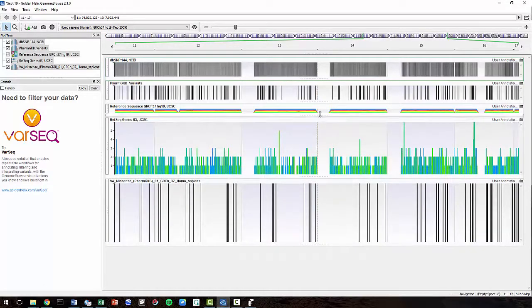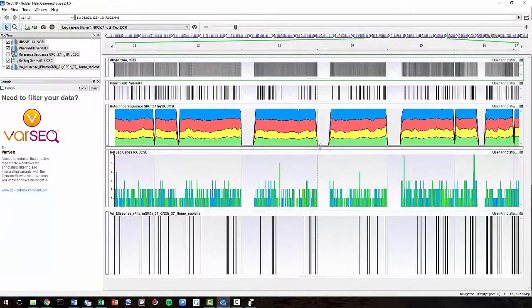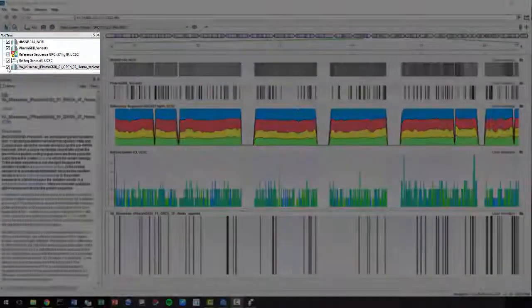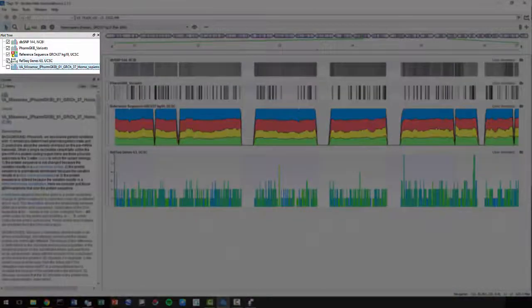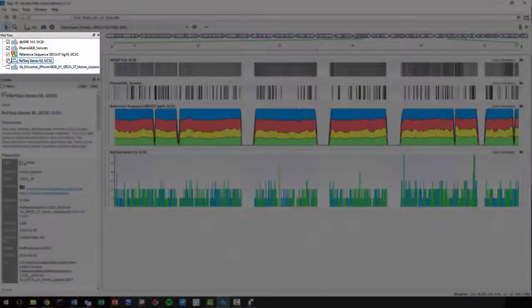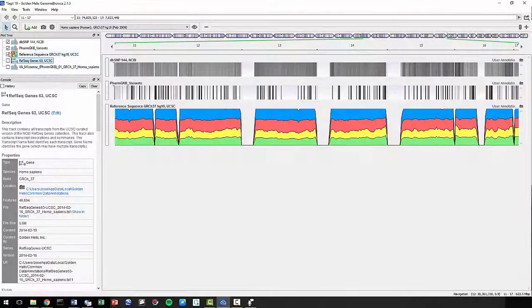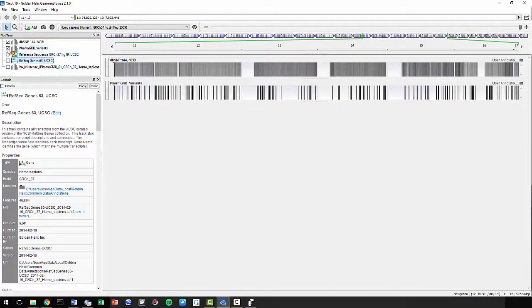We'll learn how to analyze this information later. For now, go ahead and hide the tracks by unchecking these boxes.